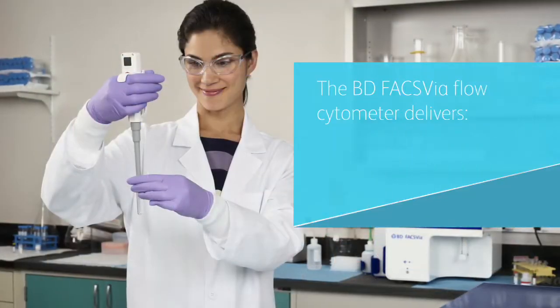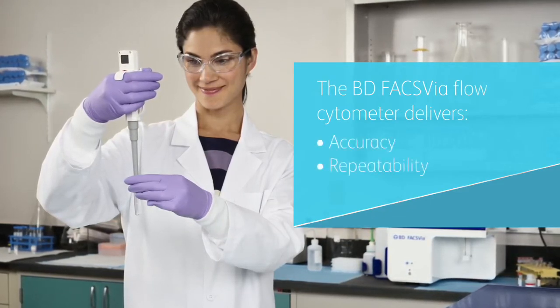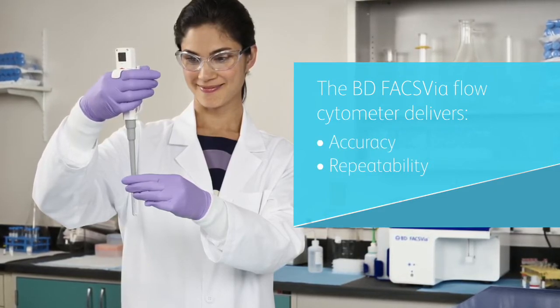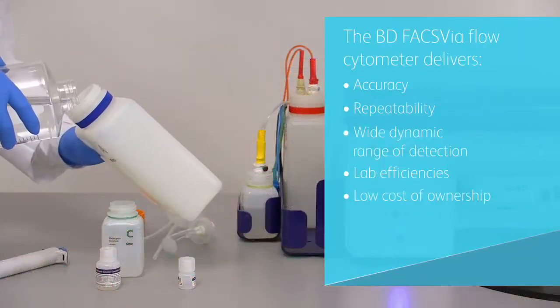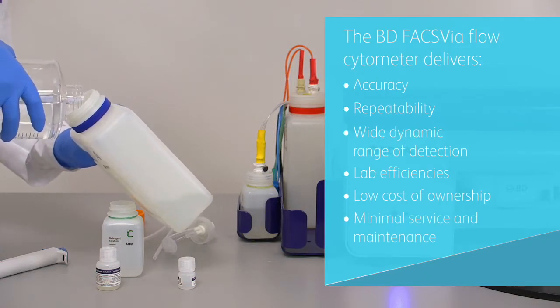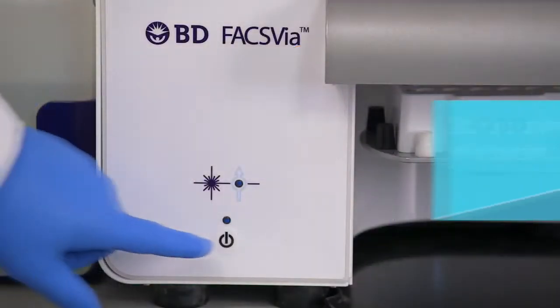The BDFAX VIA is an easy-to-use benchtop system designed to deliver accuracy and repeatability with fixed alignment, pre-optimized detector settings, automatically updated compensation, and a wide dynamic range of detection. It also features a low cost of ownership with basic instrument maintenance and cost-effective sheath fluidics — DI water and additive — replaced and refilled as needed.